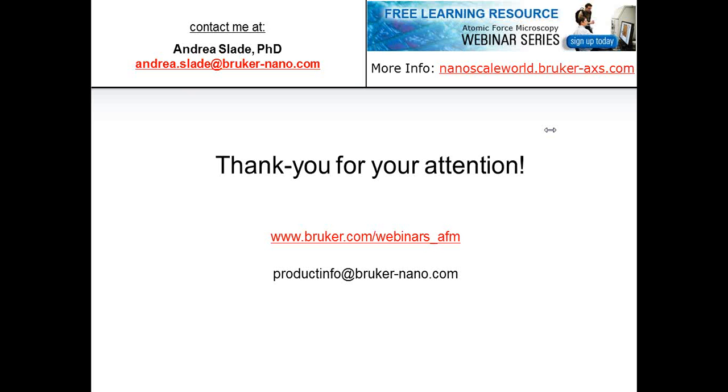You can collect one, and as long as you have the calibration parameters for your probe, you can actually substitute one for the other offline. You can apply it to the approach or the retract curve. You can include adhesion. So there's a variety of parameters you can play with. But in general, we do recommend Sneddon for these softer samples.